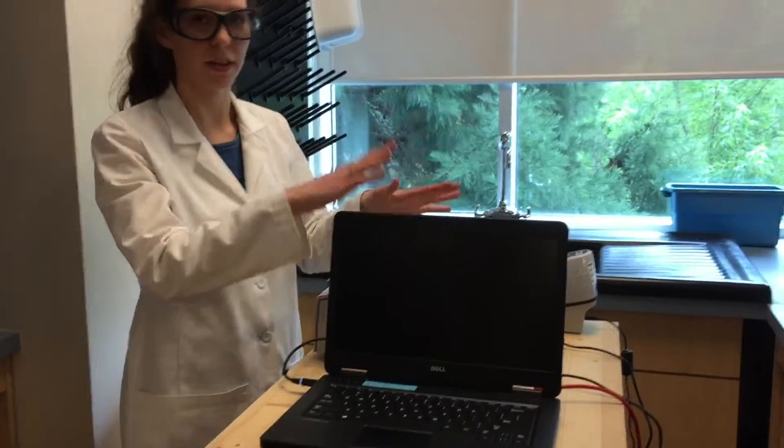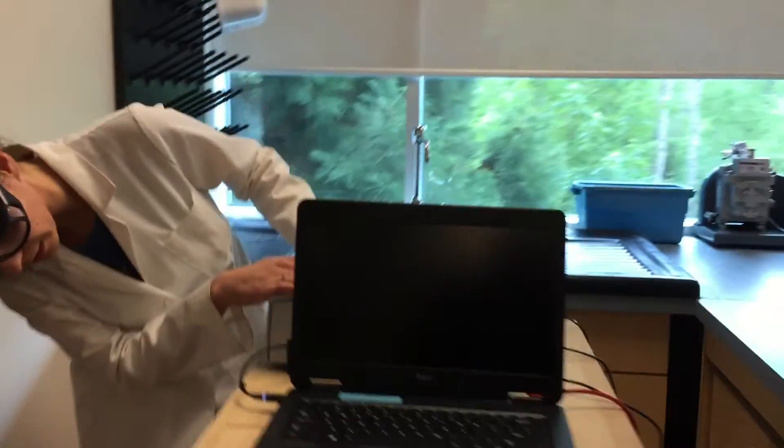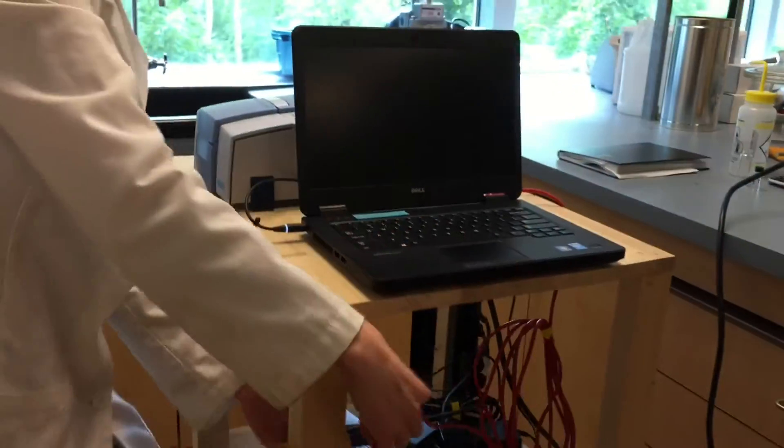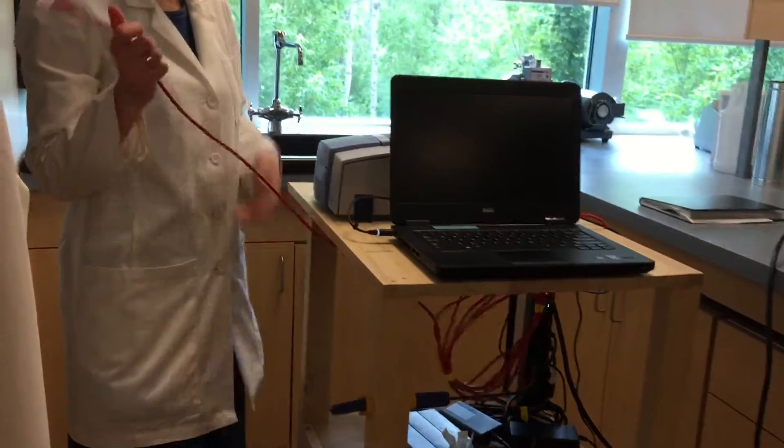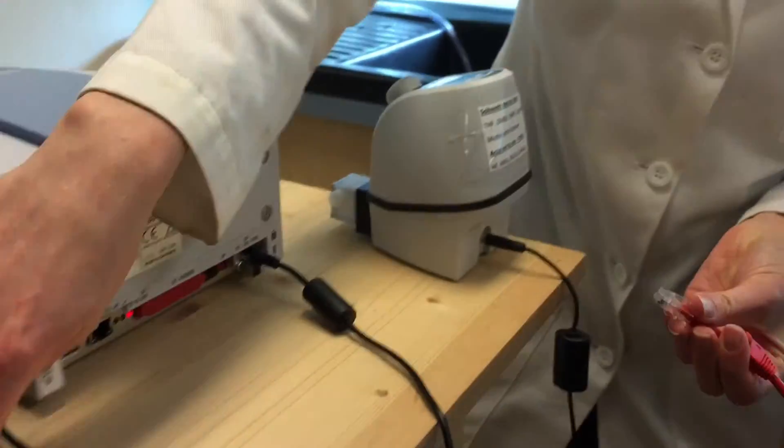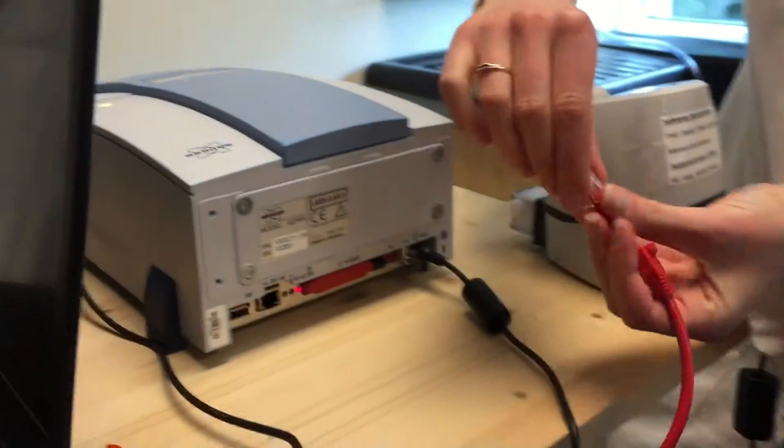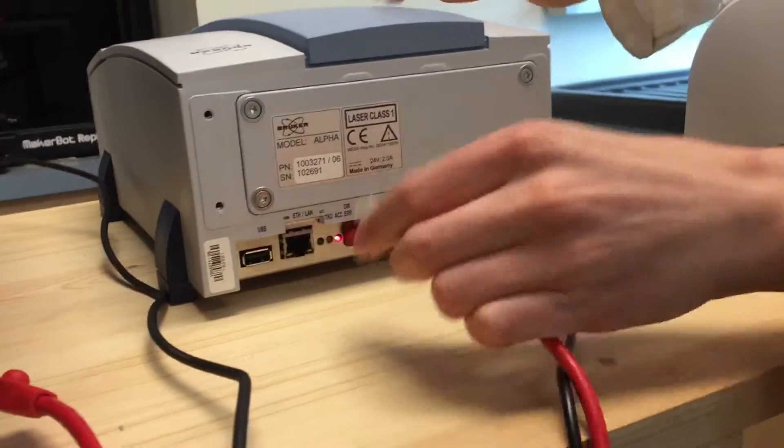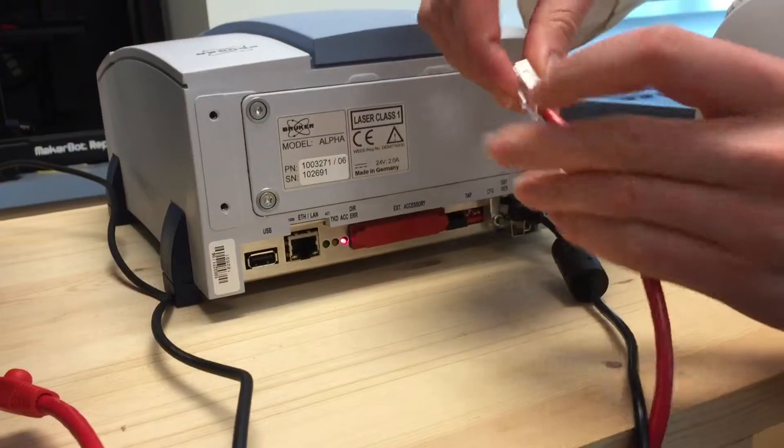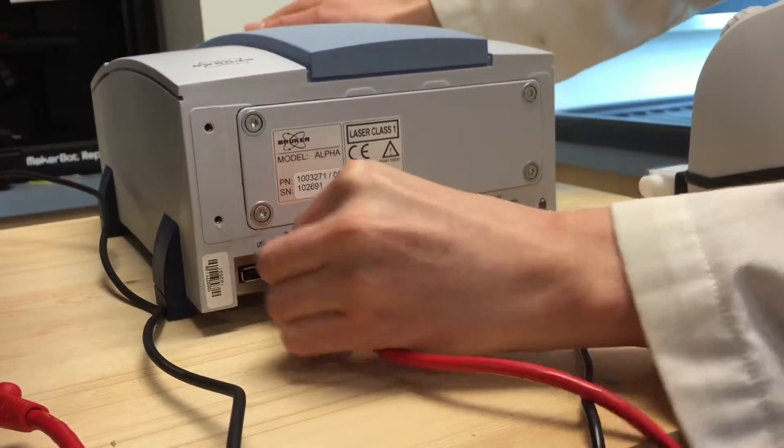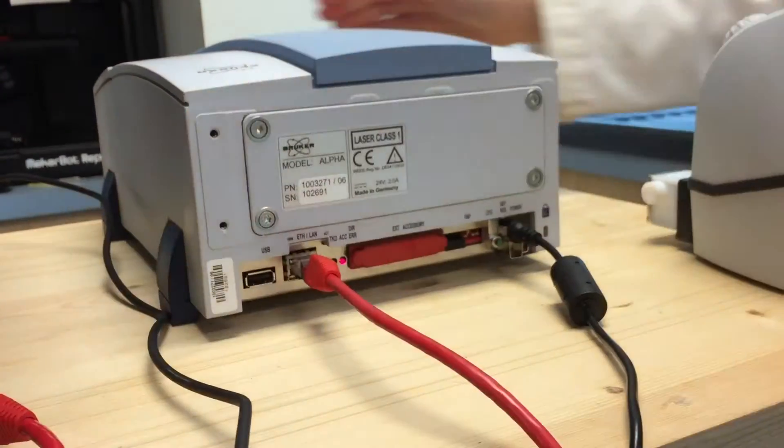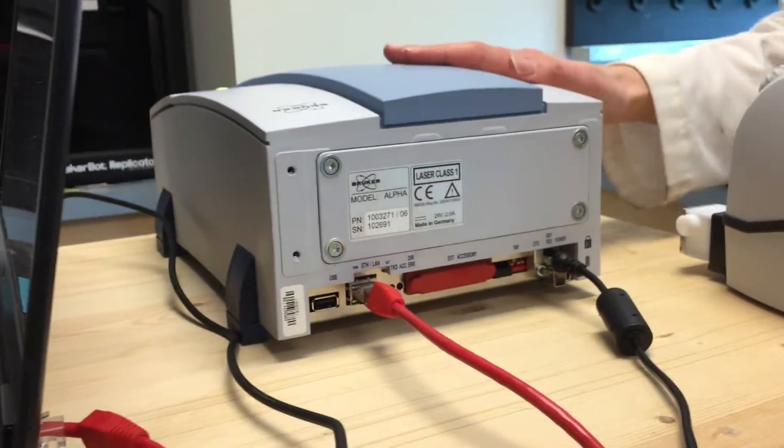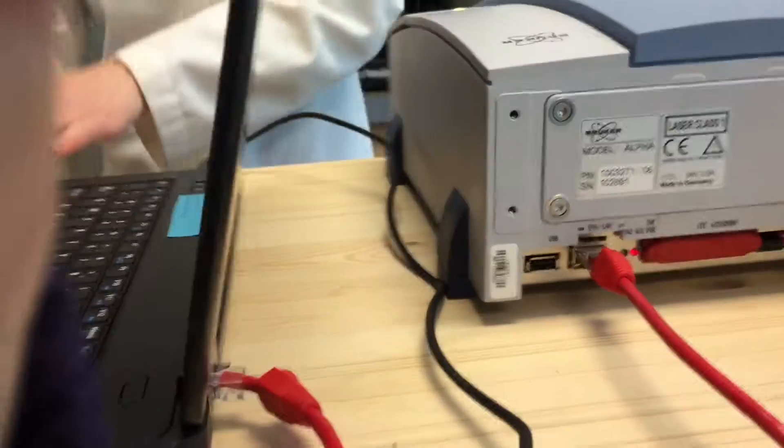And next, the laptop has to be connected to the IR through an Ethernet cable, which is this red cable. We have it connected here and then it connects to this Ethernet port back here. Now the instrument is connected to the computer.